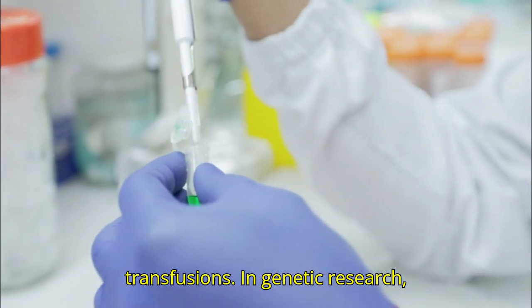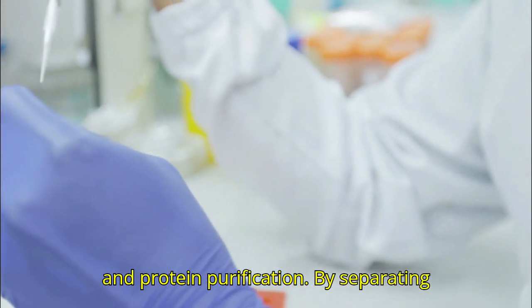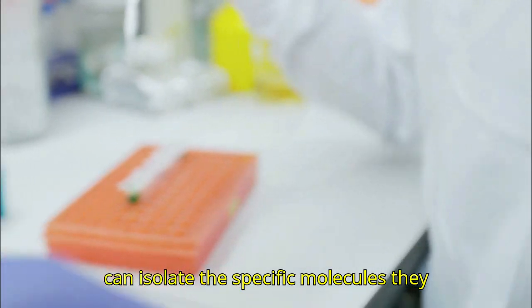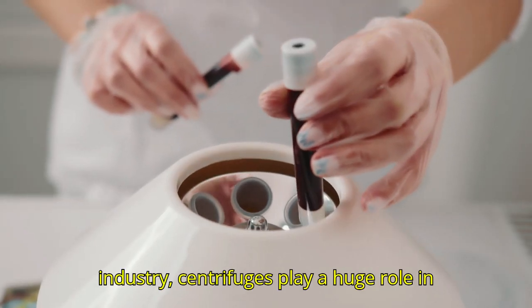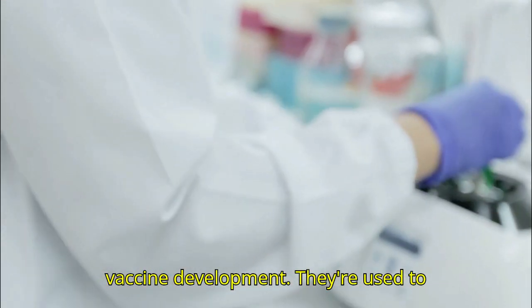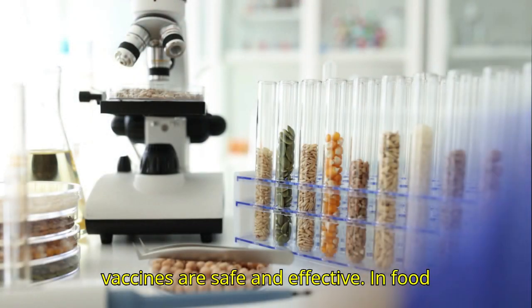In genetic research, centrifuges are used for DNA extraction and protein purification. By separating different cellular components, scientists can isolate the specific molecules they need for study. In the pharmaceutical industry, centrifuges play a huge role in vaccine development. They're used to purify viruses or cells, ensuring that vaccines are safe and effective.